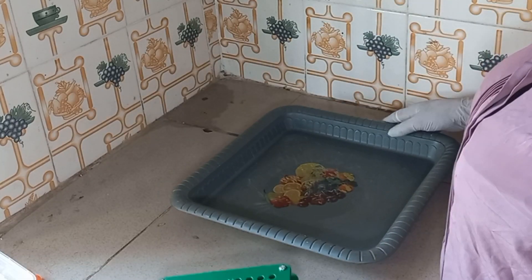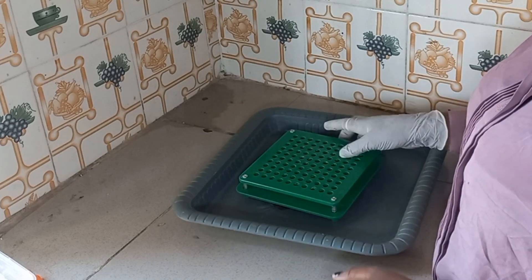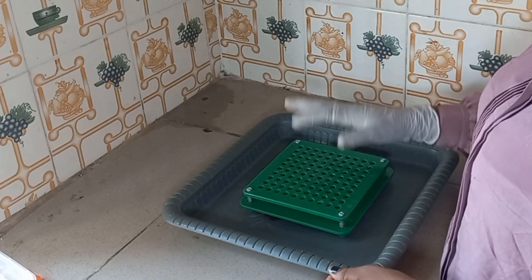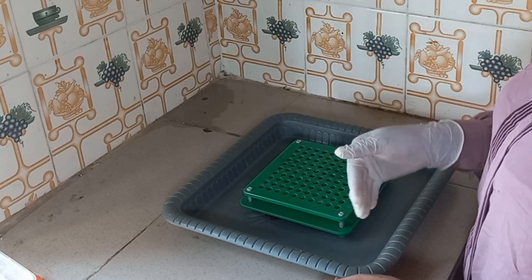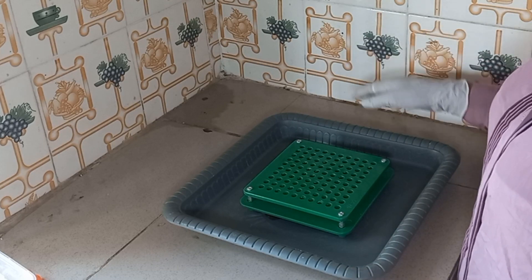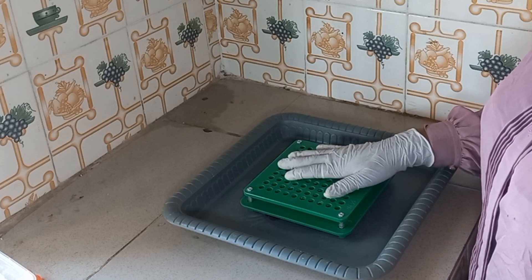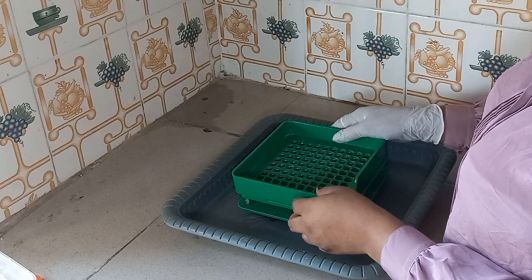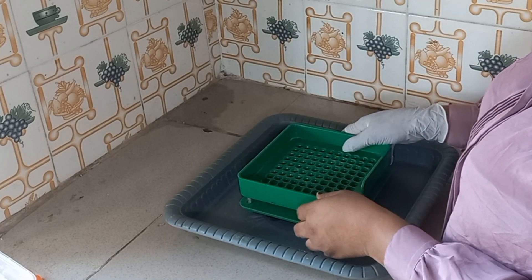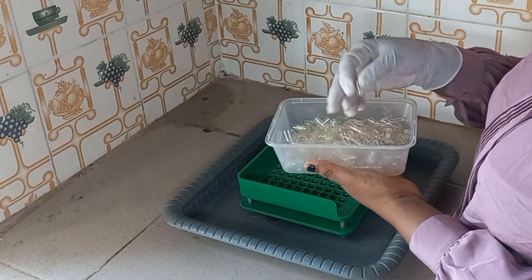Now that we are done sterilizing, I'll put the bottom part of the machine down here. The reason I'm using this tray is because even if our product spills, I'll be able to reuse it. I've placed the feeding machine on the tray, then I'm going to put this rack on like this.